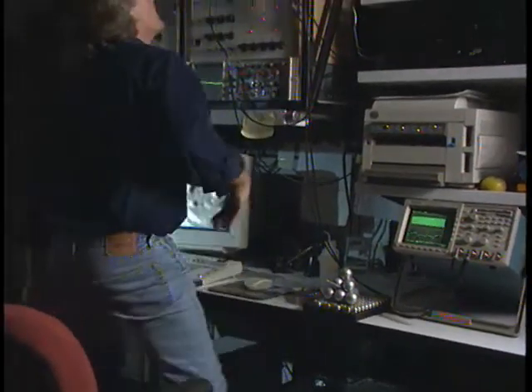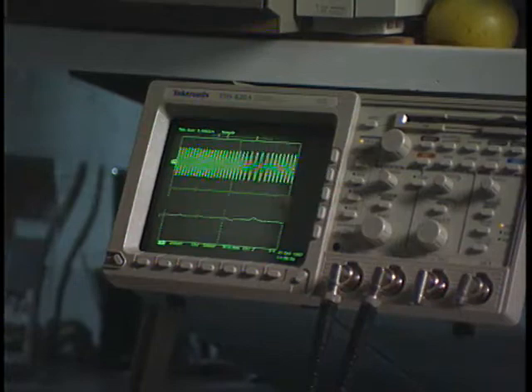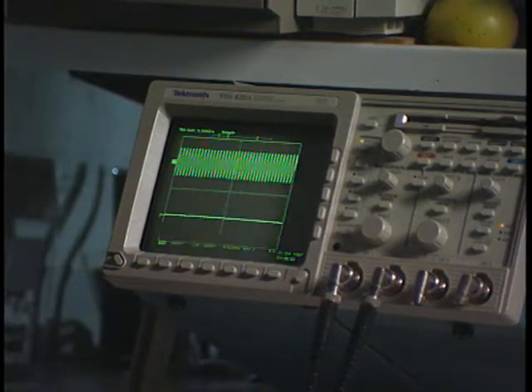The way it images is not at all like an optical microscope or even an electron microscope. Yes, they both use electrons, but an electron microscope is really much more like an optical microscope in the sense that both kinds of microscopes bend waves in order to create magnified images. An optical microscope bends light waves, an electron microscope bends electron waves.